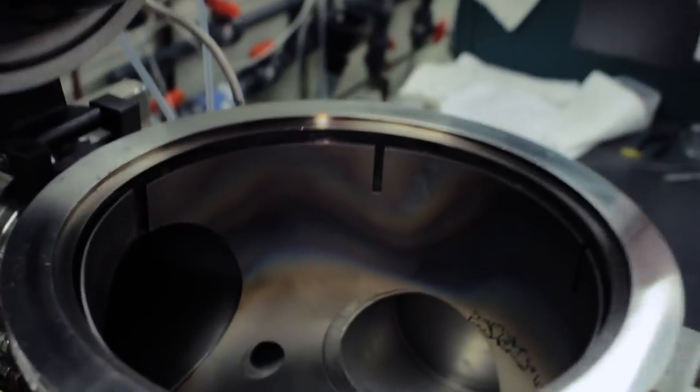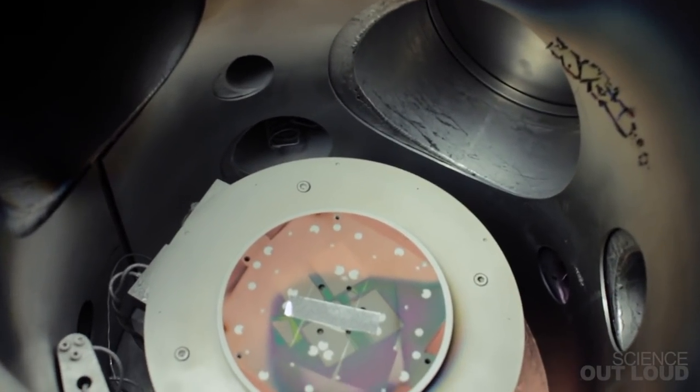Now our tungsten foil is planted with tiny iron seeds invisible to the naked eye. Let's go grow some nanotubes on them.